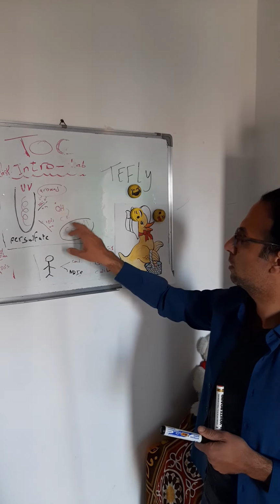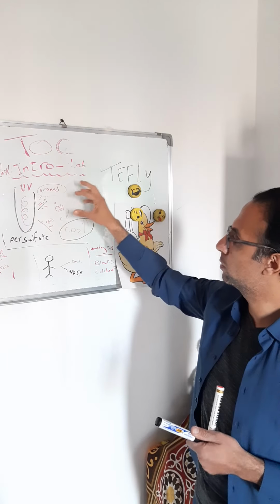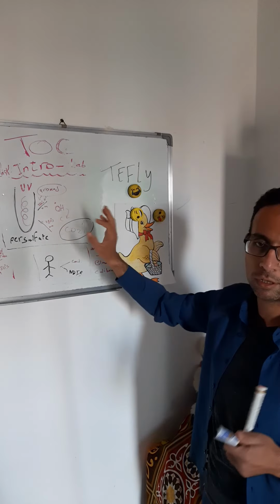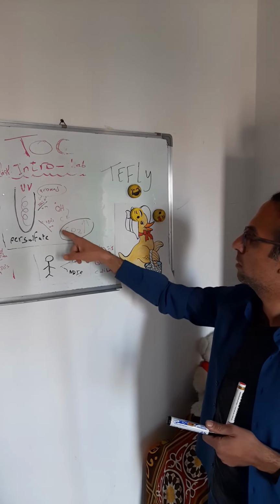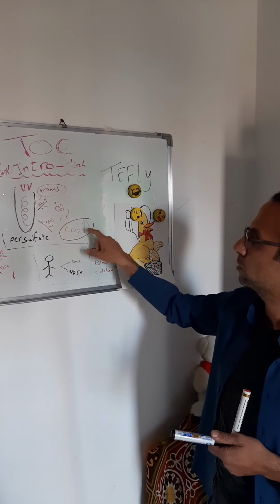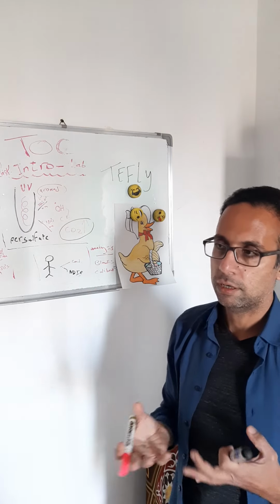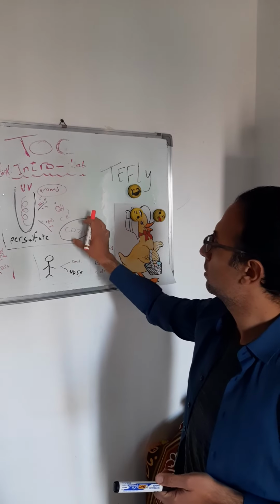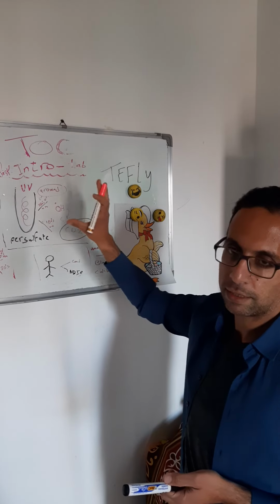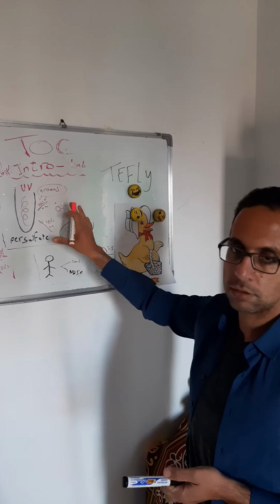This OH radical is the actual player that interacts with carbon, organic carbon, whatever the source, and produces CO2 at the end. This is the core idea of TOC, total organic carbon analysis. So this is the analysis stage, or the theory of the instrument.